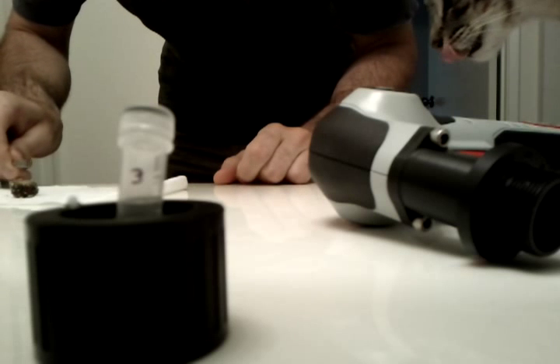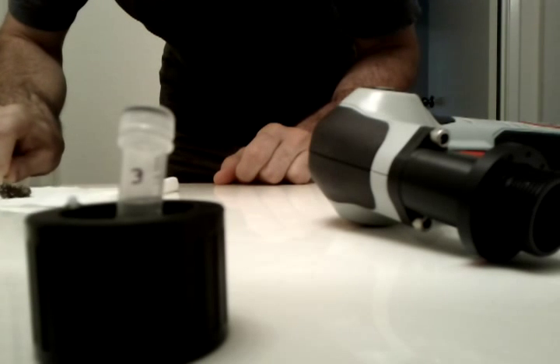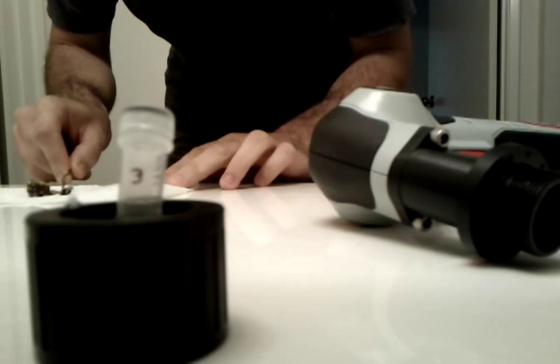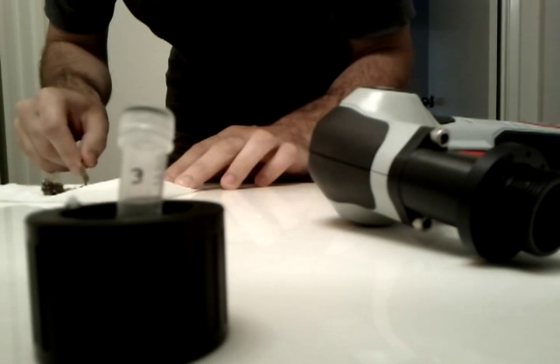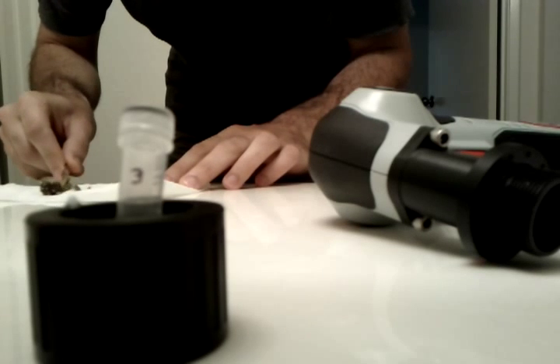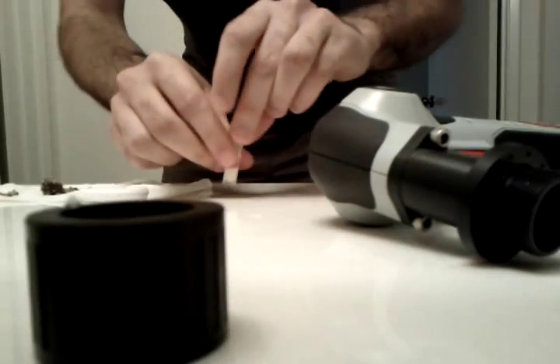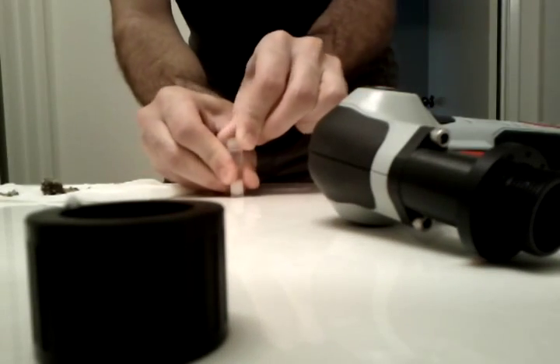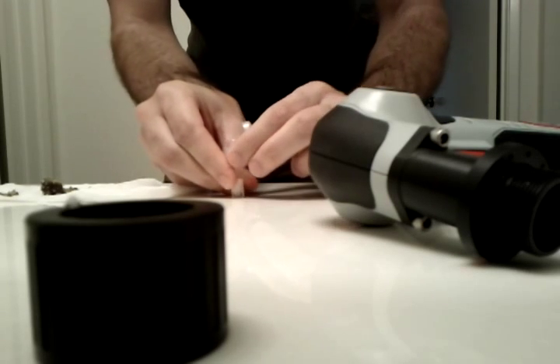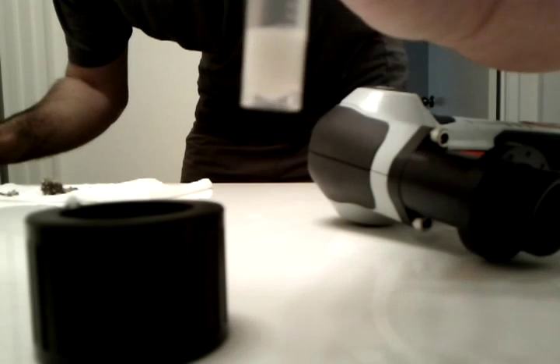Alright. So, they want about a quarter of a gram. So it's a little hard to measure it. But, this looks about right. So here's the tube. I've already put the lysis and stabilization buffer into the tube, and it's already got the beads.